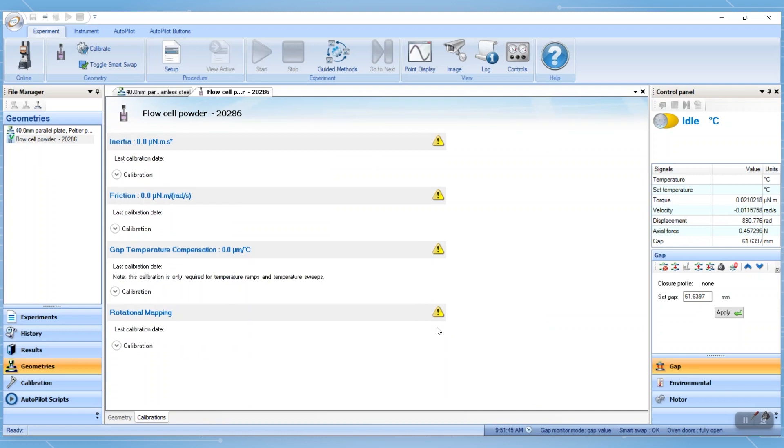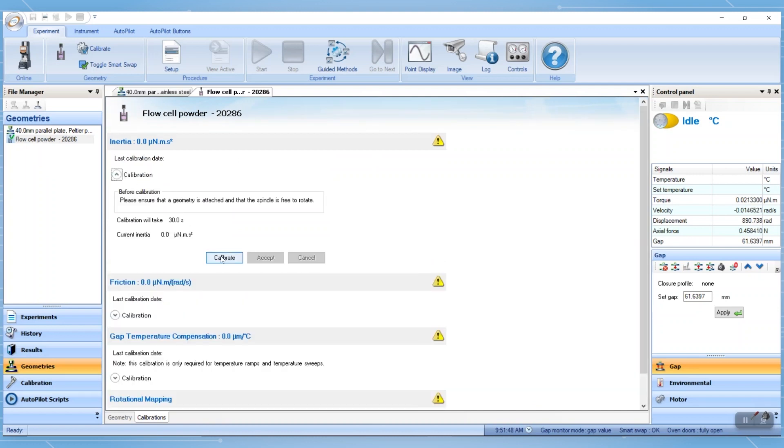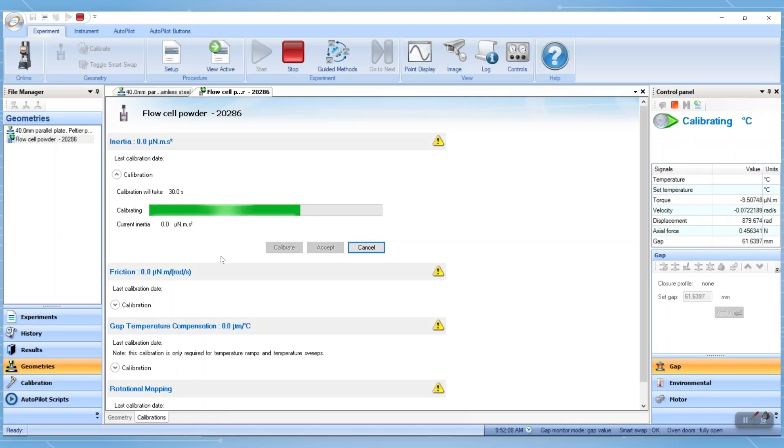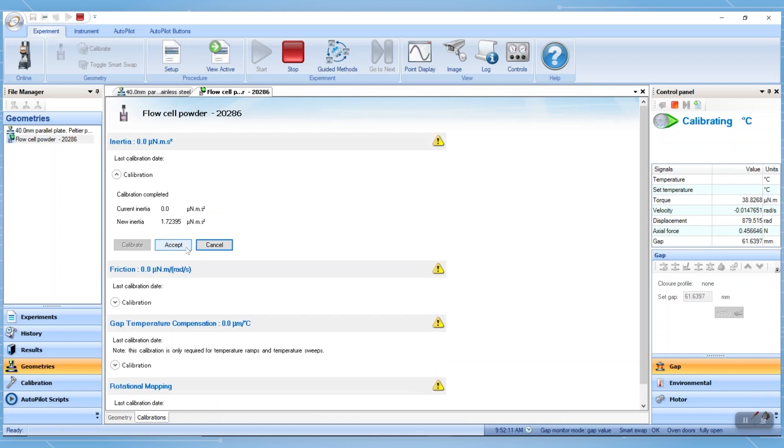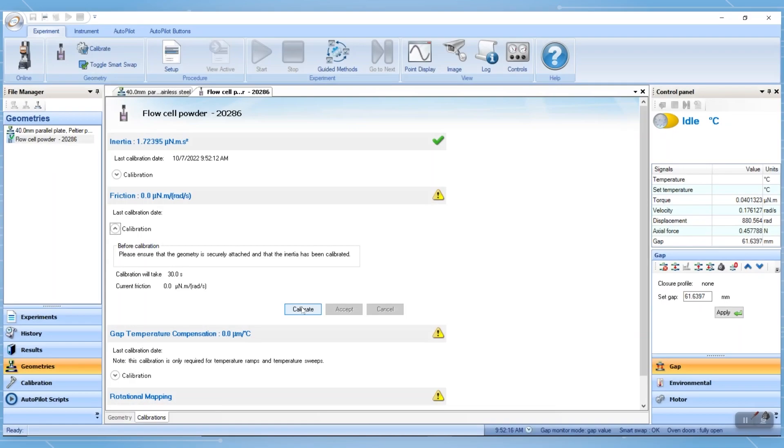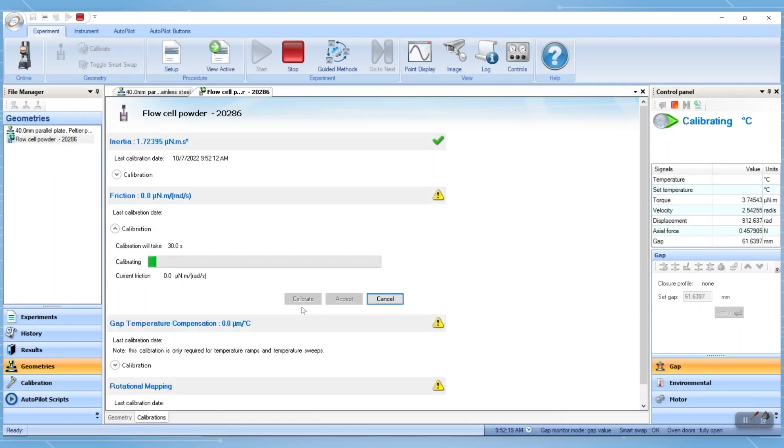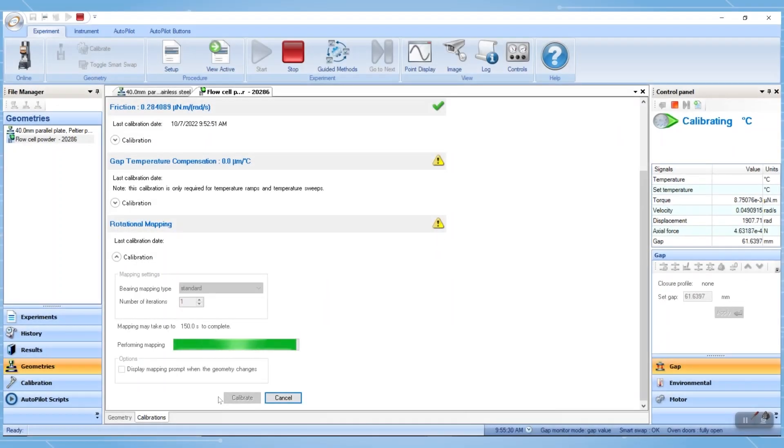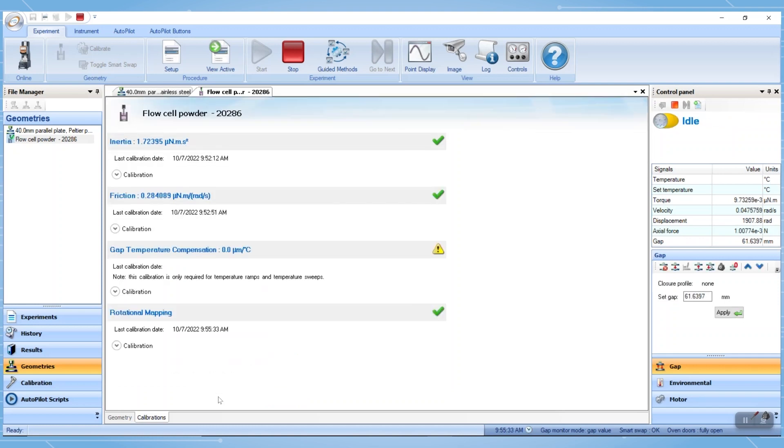Next, perform the geometry inertia, friction, and rotational mapping. The geometry inertia calibration is used to correct for the non-zero geometry moment of inertia. The friction calibration is used to correct for residual friction. Rotational mapping maps small variations in behavior around one revolution of the shaft.